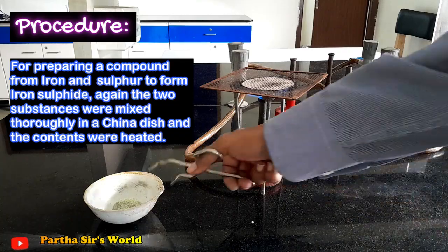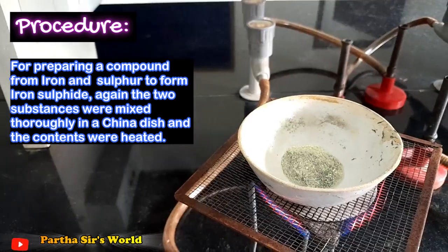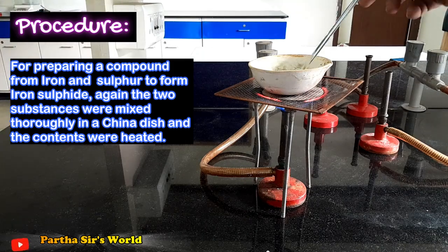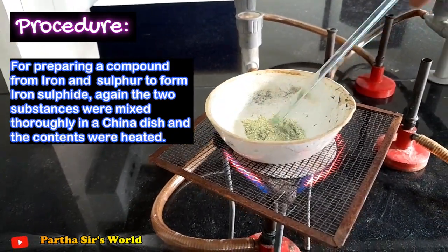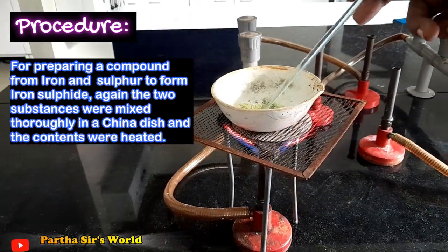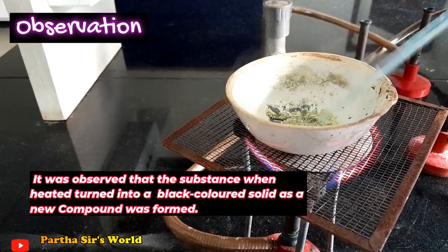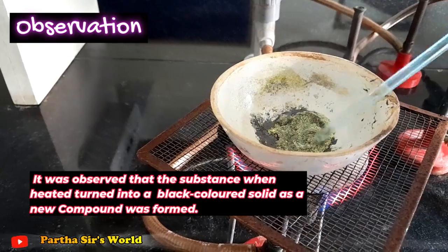For preparing a compound from iron and sulfur to form iron sulfide, again the two substances were mixed thoroughly in a china dish and the contents were heated. It was observed that the substance, when heated, turned into a black colored solid as a new compound was formed.